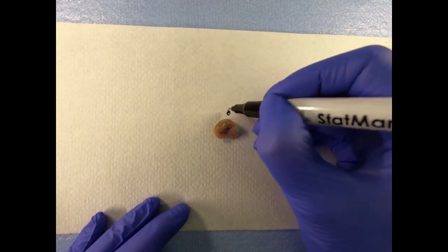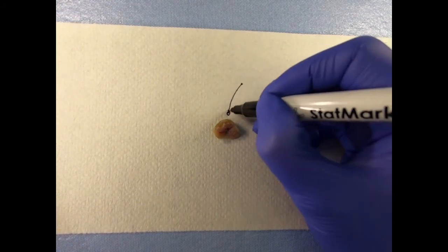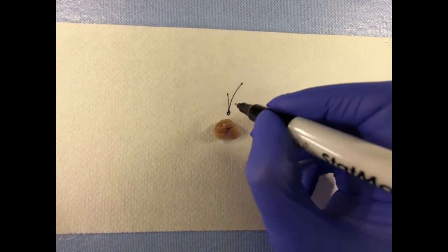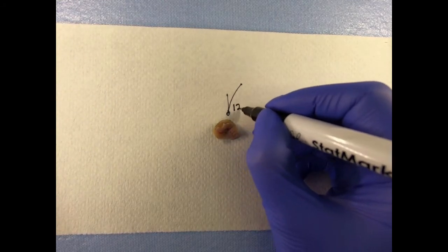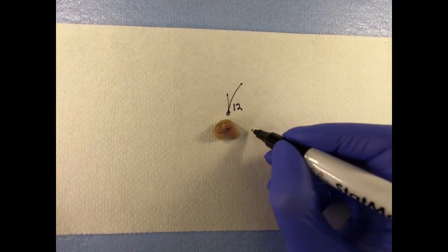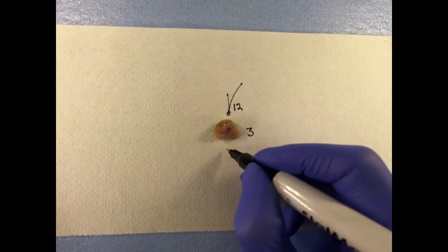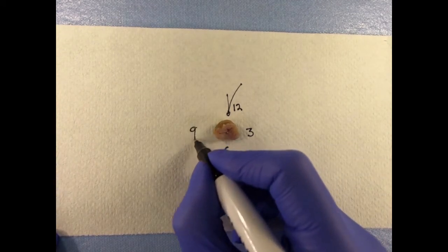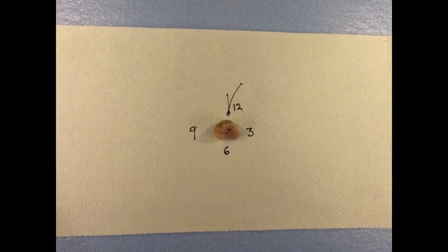They are generally oriented with a single suture or ink designating a specified position, such as 12 o'clock or anterior. The clockwork technique utilizes a clock face template to orient specimens that is independent of anatomical orientation, allowing for accurate coordination between the clinical and laboratory setting.